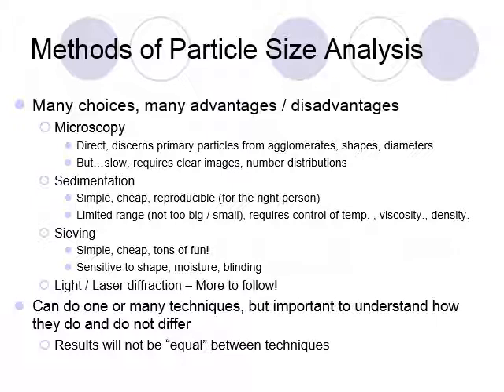I'll have customers call me with sieve data and want me to convert it to diffraction data by taking diffraction measurements. And I can do that, but there are caveats. Understanding the techniques is how we find these caveats and learn how best to give the customers the answer that they're looking for. The same would apply to your research when you work with a certain tool or try to work something versus a paper. You need to understand how you get the data you get from each technique and how to walk between them with the right interpretations.